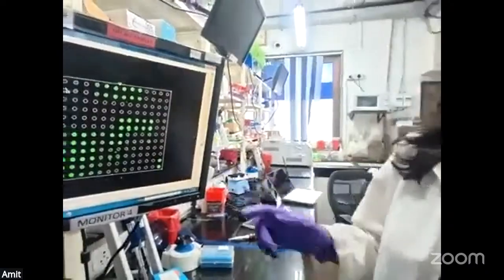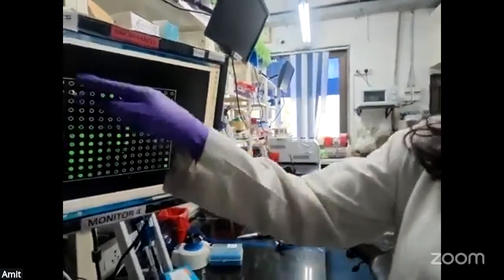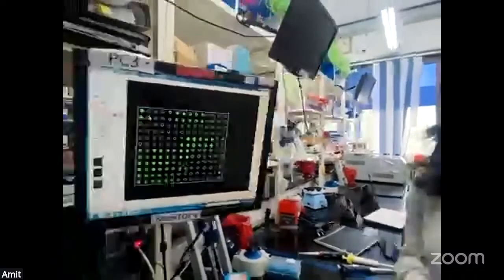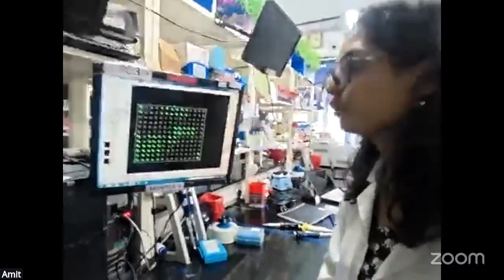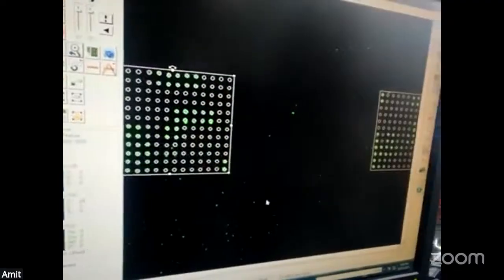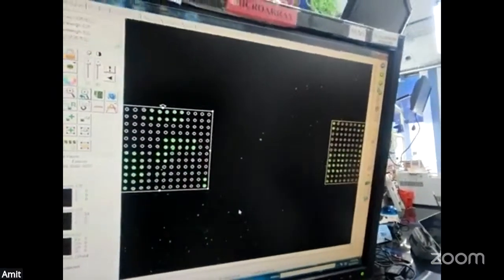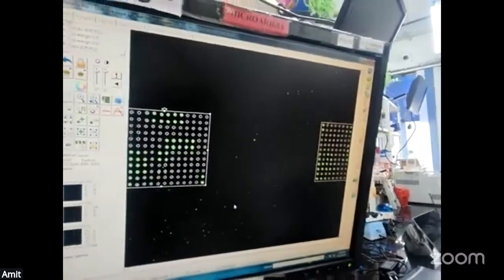So we do the intra-block, or inter-spot, or inter-feature correlation to detect if we have reliable data. Also, if we zoom out, we have these similar proteins in two blocks. So we can check the intensity as inter-block correlation, and we can perform a quality control check of our data.